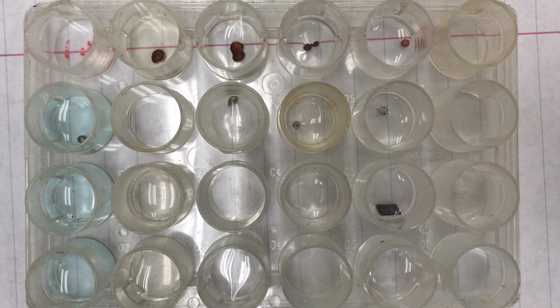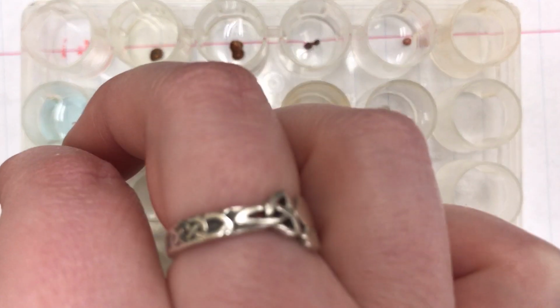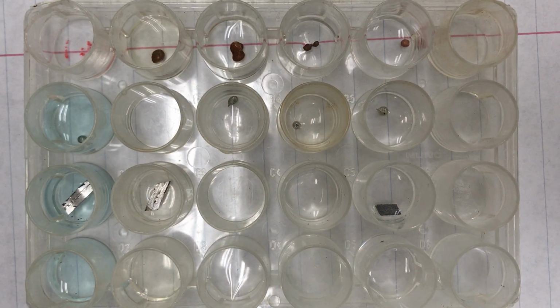Right, in step 7, we're adding magnesium ribbon to row C. Make note of color and state before a reaction happens.